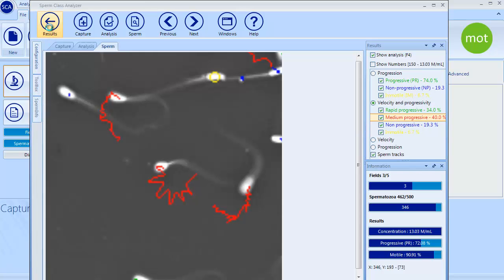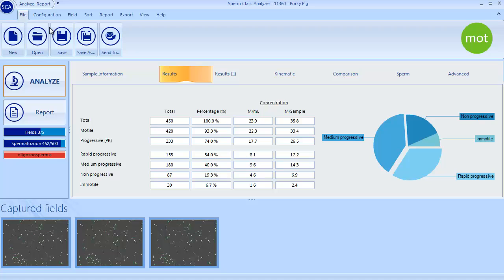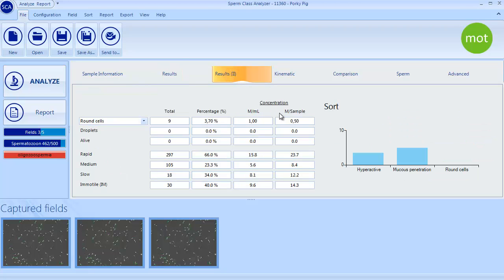Clicking on Results, Capture window closes and results can be checked in Analysis window presented in Table or Graphic format.